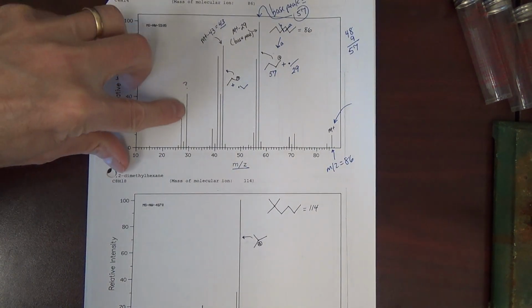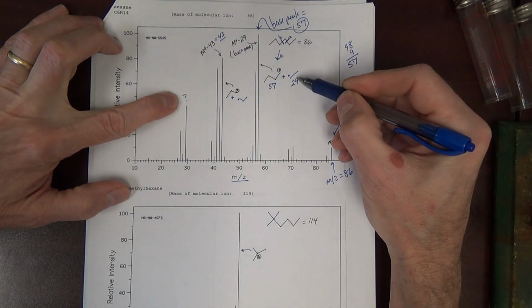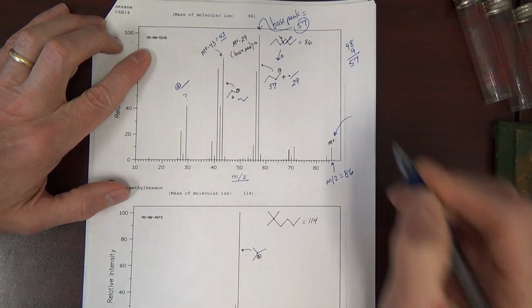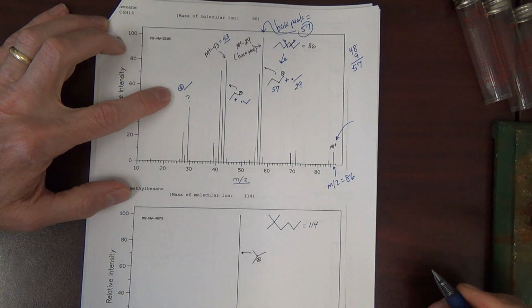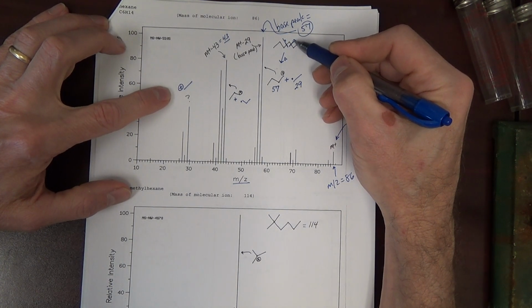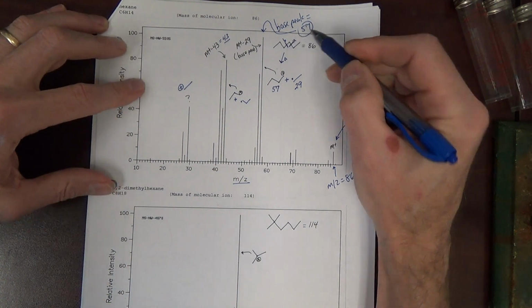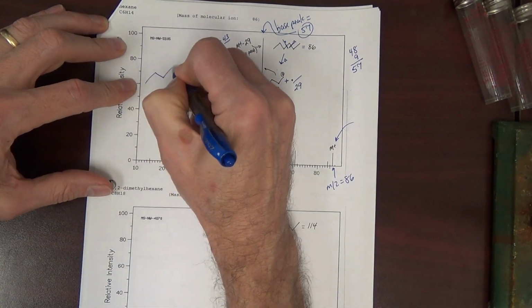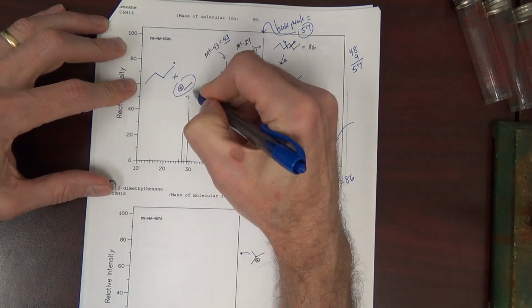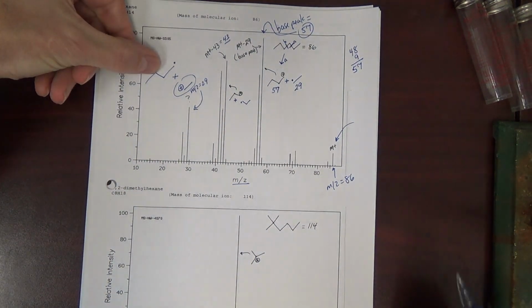Before we move down there, what could this peak be here at 29? Importantly, it's certainly not this radical, because neutral radicals don't give peaks in the mass spec. It's most likely just an ethyl cation. That is, we cleaved at the same spot, but mechanistically, the cation was apparently left on this carbon, and the radical was left over there. So we would make that cation plus a 4-carbon radical. If cleavage gave us these two, then this would be our m/z equals 29, and it would register a peak where the neutral radical would not give a peak.